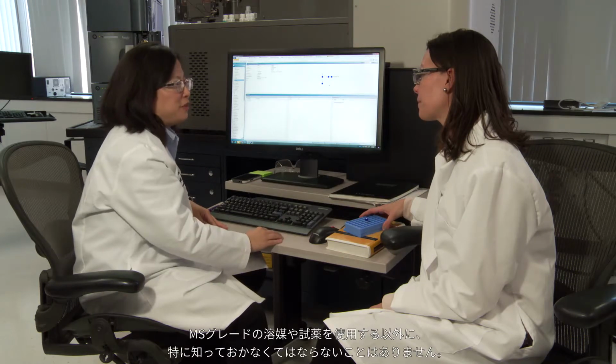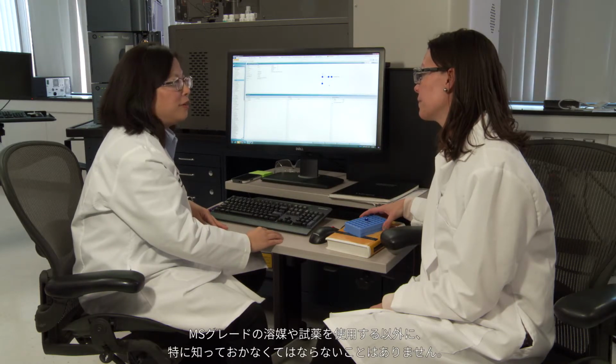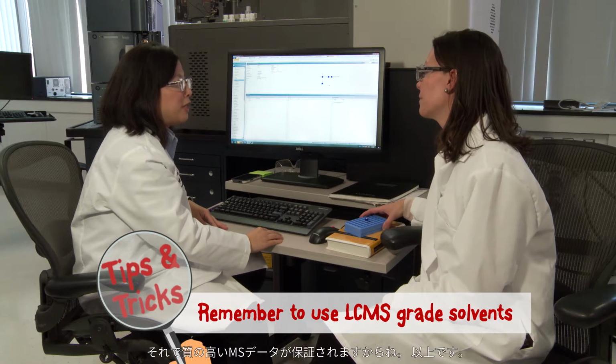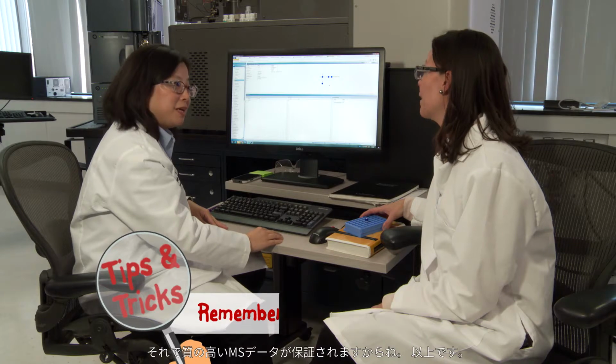There's really not many tips and tricks you need to know other than using MS-grade solvent and reagent, because that will guarantee you good quality MS data. That's it. All right, great.